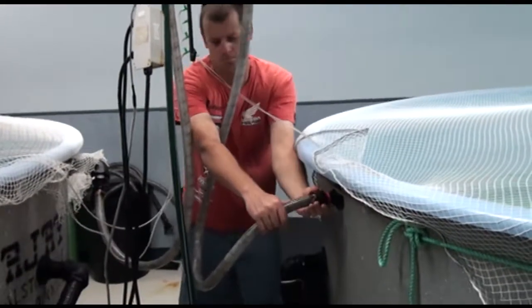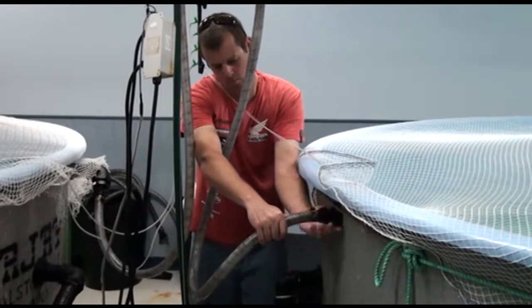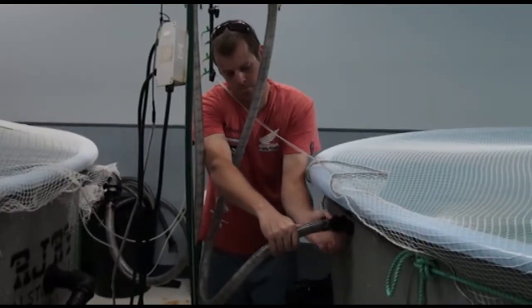Next, connect seawater to the tank. Then run seawater into the tank. The tank should approach full seawater salinity within 12 hours.